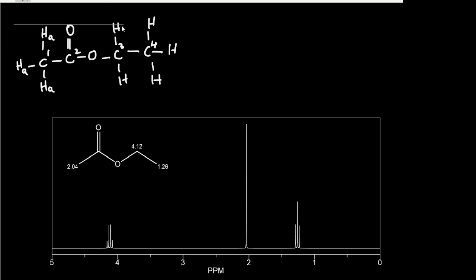So there is no proton here, no proton here. On the third carbon, there are two protons. So these are B type. They are attached to the same carbon, so they are in the same environment. So they are B type of protons. You may name them by any other letter, but this is easiest for me.